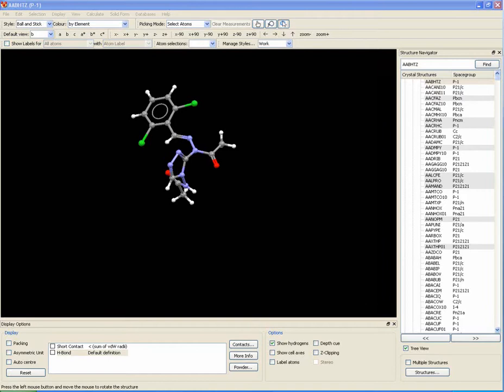How to reveal neighboring molecules in a crystal structure. You may want to find out what is next to a molecule in a crystal structure, however you would have to know what you were looking for and edit the contact options accordingly.